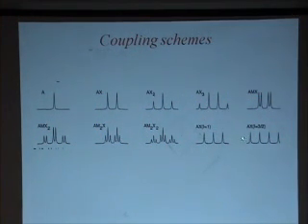Now, if you have, for example, a spin half nucleus, such as a proton, coupled to a nucleus which has spin 3/2, such as boron, the direct coupling of the proton with the boron, the 3/2 quadrupolar nucleus, will give you 4 peaks, because the degeneracy associated with spin 3/2 is 4. So you will get 4 distinct peaks.